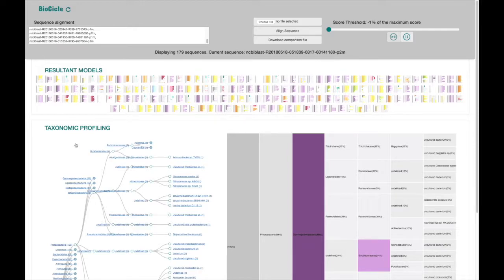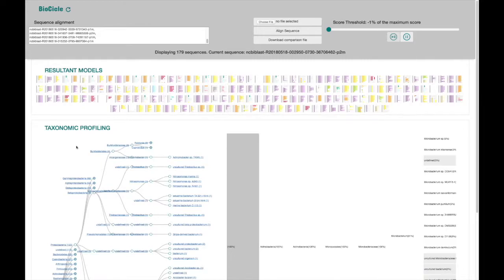Considering the amount of nodes it can have, it is presented as a collapsible tree that dynamically expands its nodes according to the number of visible children. The nodes in the dendrogram are sorted following the number of results containing sequences with such node in their taxonomy.